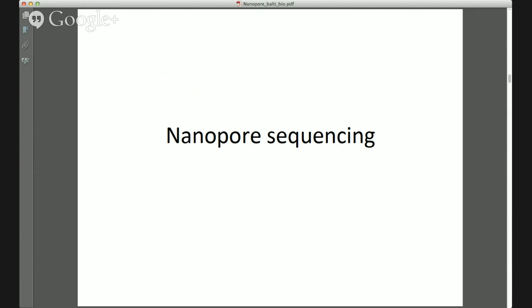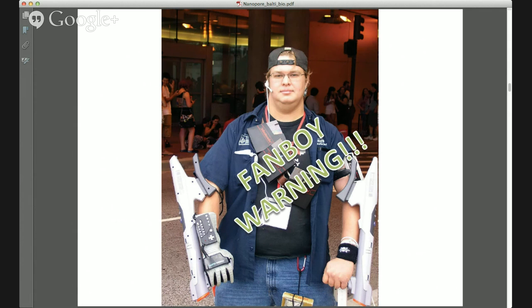Talk about nanopore sequencing, and that's the kind of the view of why I'm interested in this. So I put this slide up when I spoke in Oxford last week, and if you don't recognise this, it's a fanboy picture from Wikipedia. It's a particular type of fanboy who likes Nintendo stuff, wearing all of the gear there, some cartridges, some of Nintendo's less popular add-ons. And I guess I am a bit of a nanopore fanboy in the sense that I can see its potential. And I'm very excited about it, and I'm one of the people lucky enough to be in the MinION Access program, and so yes, I think I have some amount of natural bias associated with that position. So my role is to try and get you enthusiastic as well, because ideally I want to be on the right side of history, and I want you to be as well.